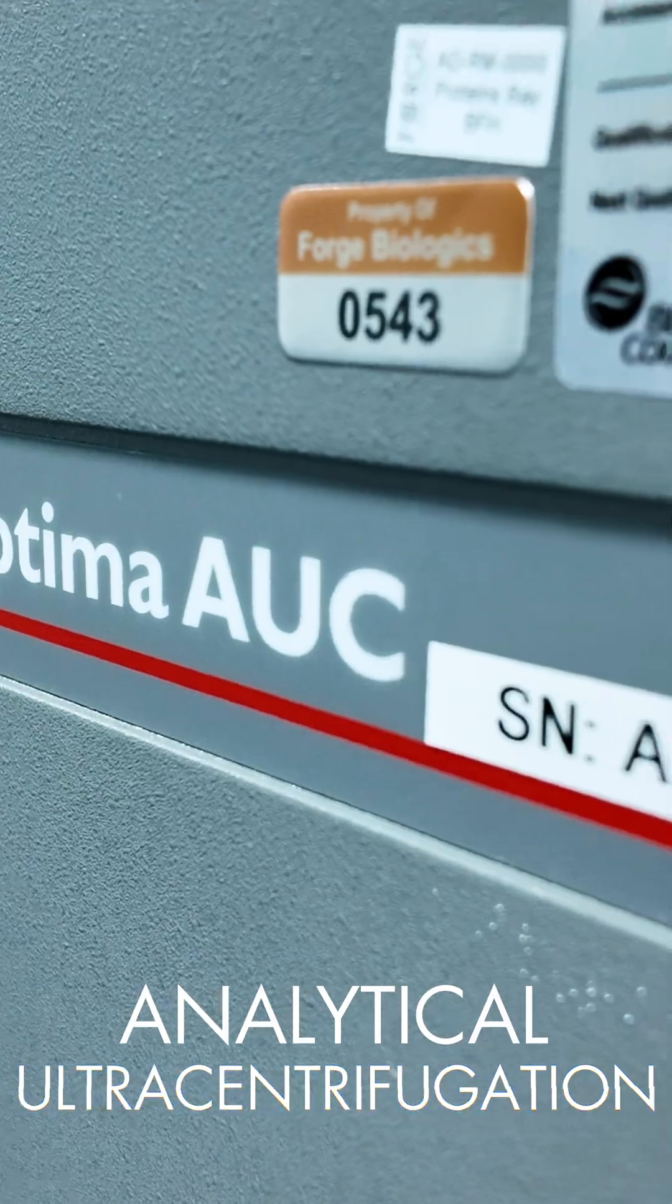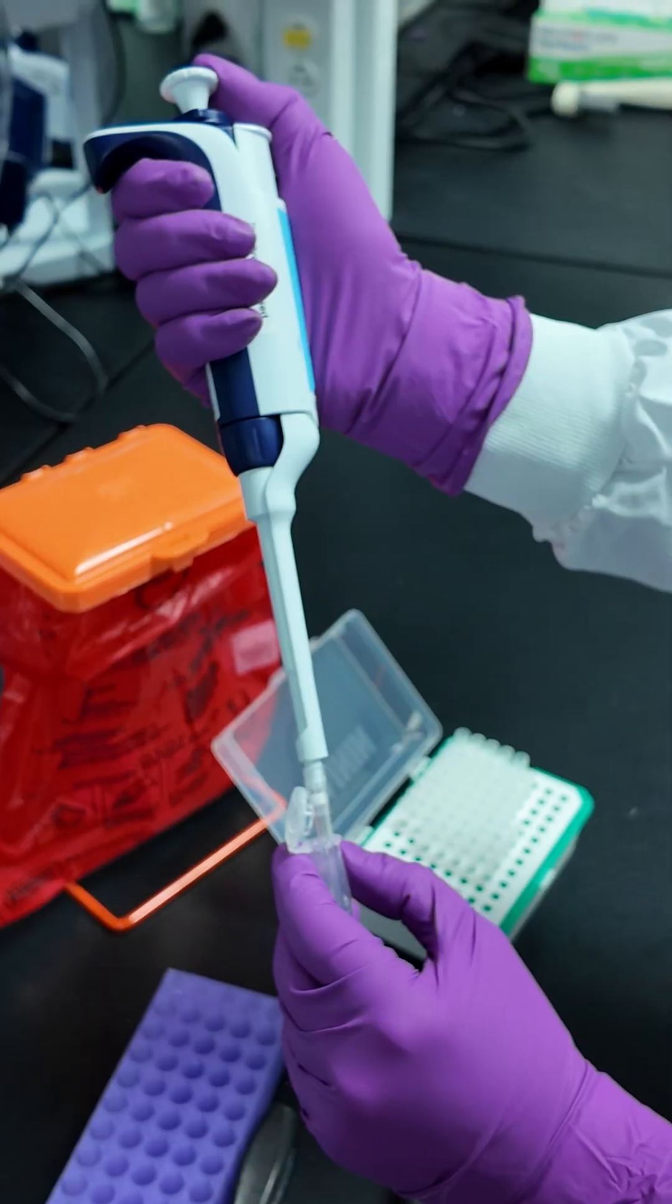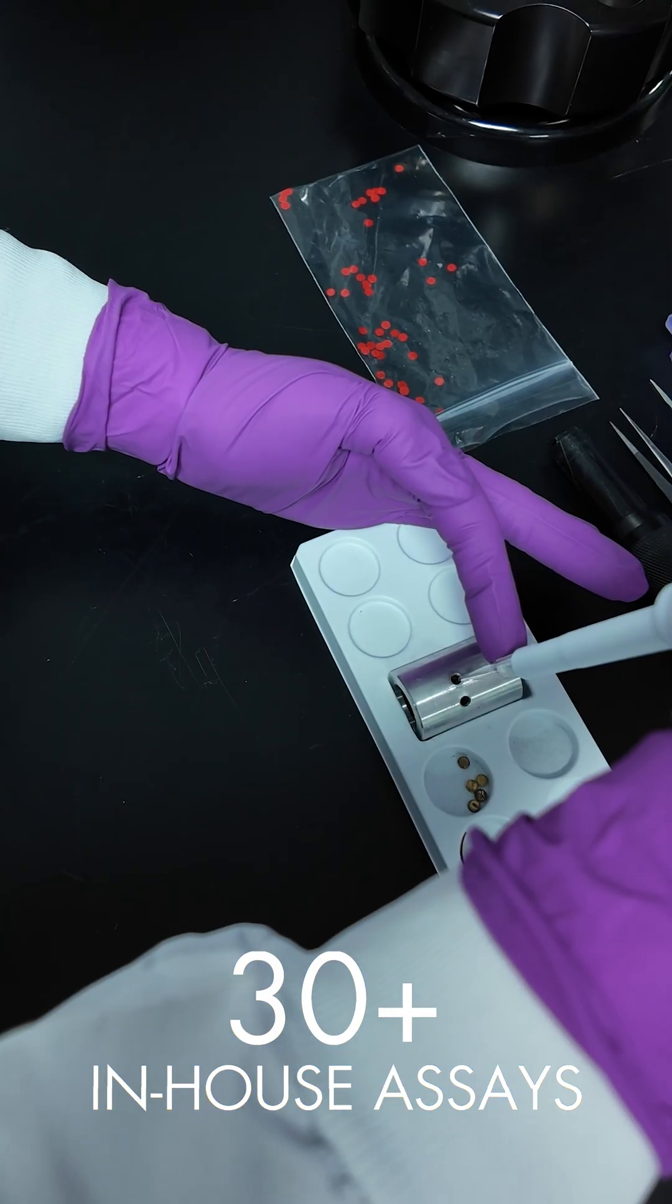AUC, or analytical ultra centrifugation, is one of the 30 plus in-house assays we offer clients here at FORGE.